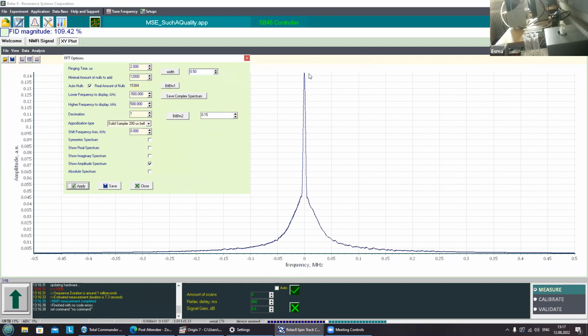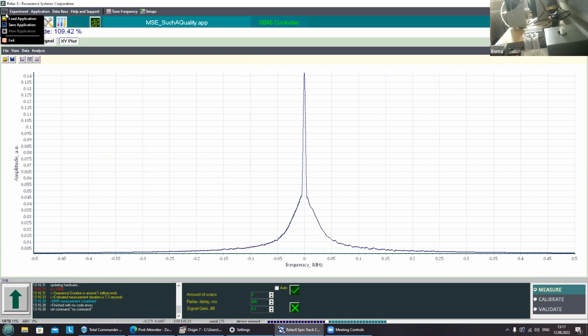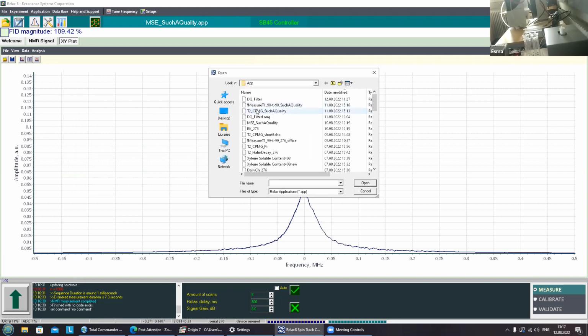And here we are. This is the spectrum that we obtained. The narrower peak is coming from the long component, and these tiny doublets are probably coming from the amorphous or semi-crystalline part, and we have some other doublets in here. But if you make the double quantum measurements, it will change totally. I will close this measurement right now, and I will go to double quantum filters MSE.